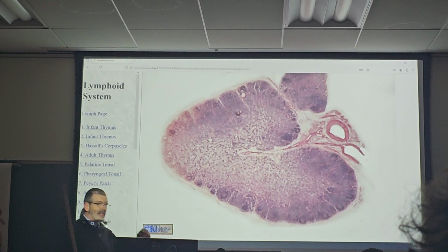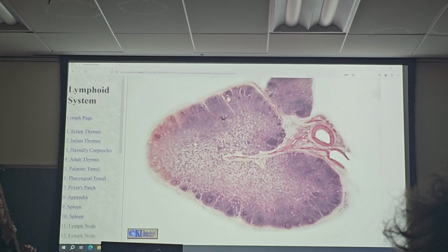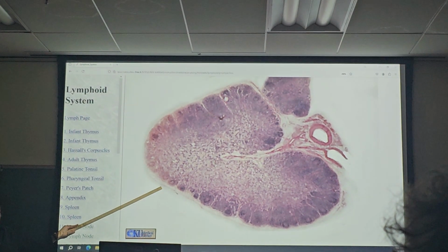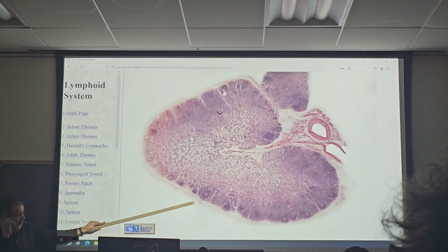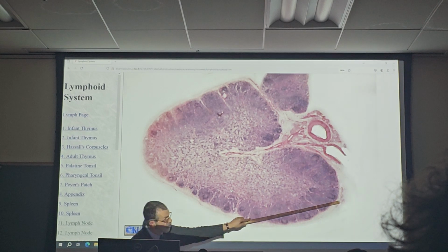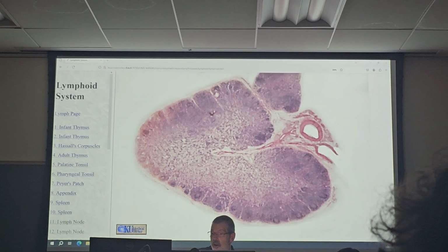So the capsule is the very outside part you touch. So if you look carefully with my magical stick, if you look right here, there's a layer just outside the darkness, that little edge. That's the capsule, that's the part you would touch and put your hand on. It's here, it's over here. So it's gonna be the outermost edge, not dark, it's just gonna be the outermost.